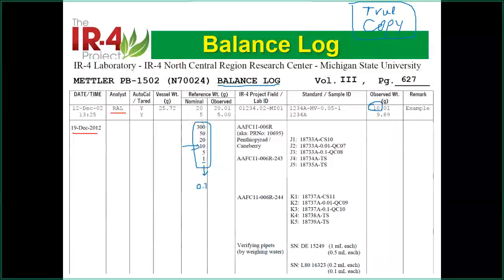You have a little bit of calibration because the balance itself has auto cal. Okay, you can do that, and that will give you a certain range because it's built in. This is already a calibration for the balance. Of course, you do have a balance calibration, like the annual calibration for the balance. So that's one thing. It's good. The balance is good. There's nothing wrong.